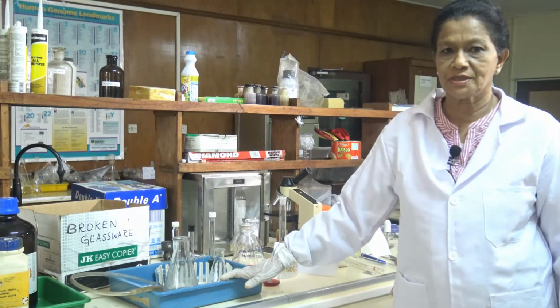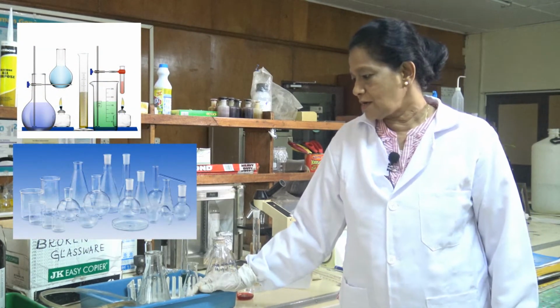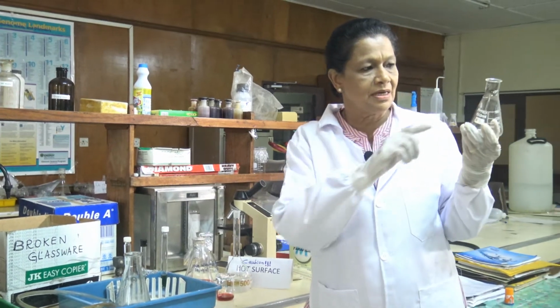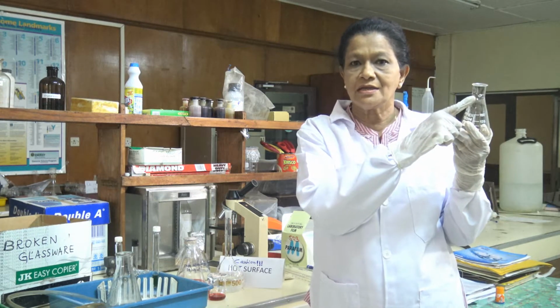Let's move on to the second material, glassware. Before use, all glassware should be checked to ensure that there are no cracks and flaws or scratches that may cause it to fail in its use.